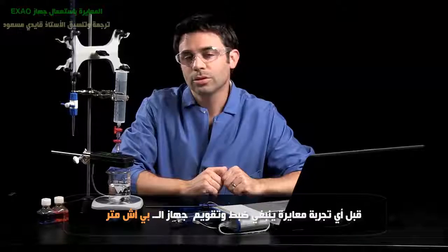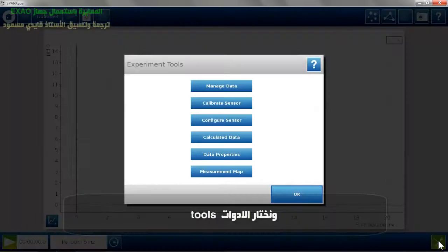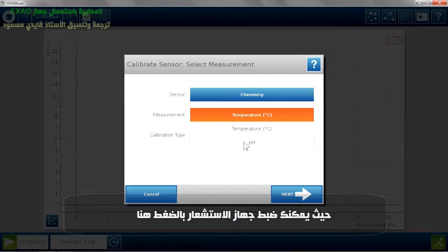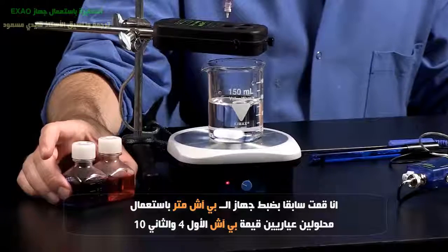Now with any titration, you want to do some calibrations beforehand. You want to calibrate the pH meter. To calibrate in SPARC, you go to the tools and you can calibrate your sensor — in this case, the chemistry sensor and the pH. I already pre-calibrated this with buffers 4 and 10.